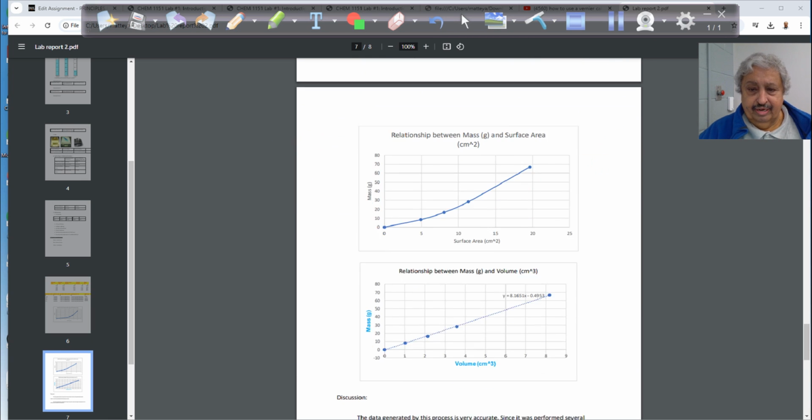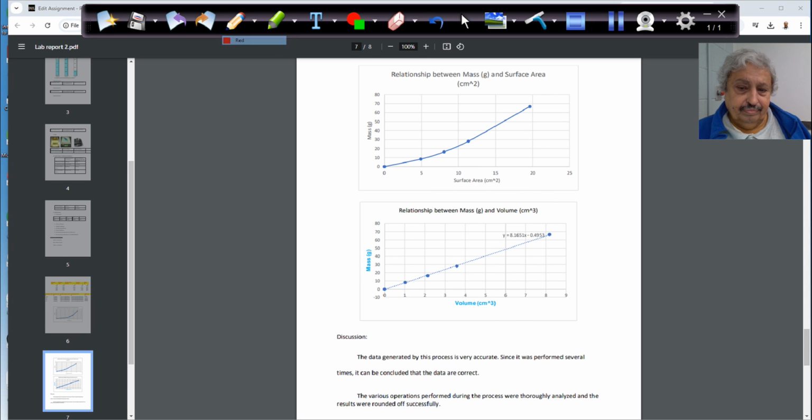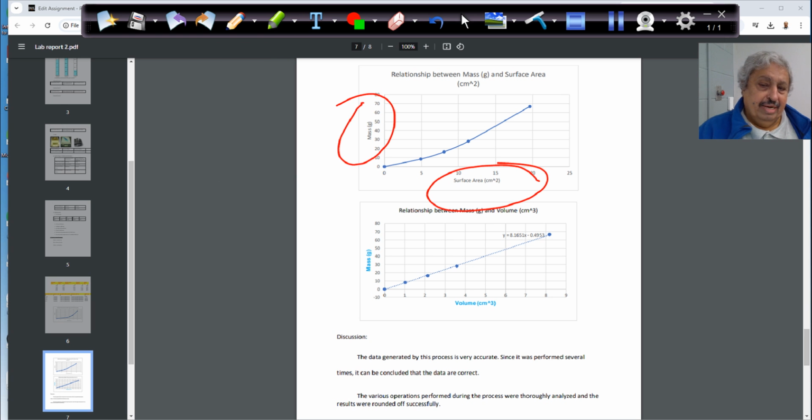The second one, you can have the surface area against the mass. Mass against surface area, all from the table you have above. Remember the table? What you need today, you can do the whole thing at home, but I need you to measure, including the 0, 0, 0 coordinates, the diameter of 4 balls, and their masses. And the rest, Excel will do it for you.